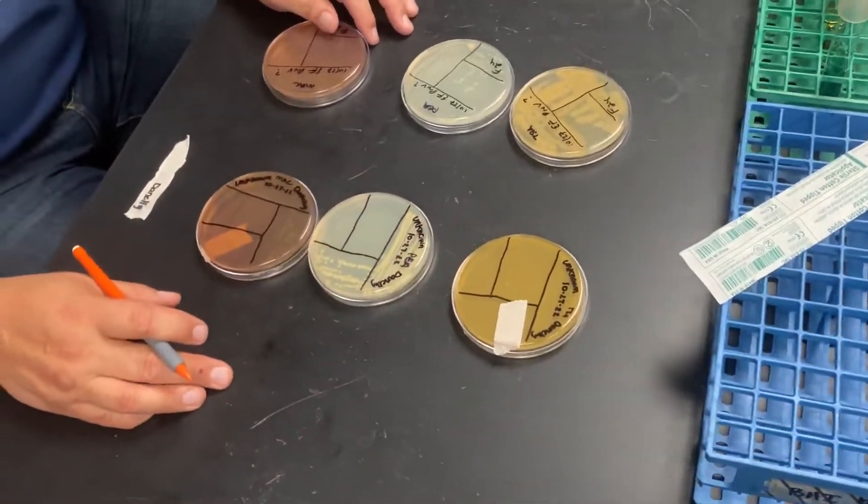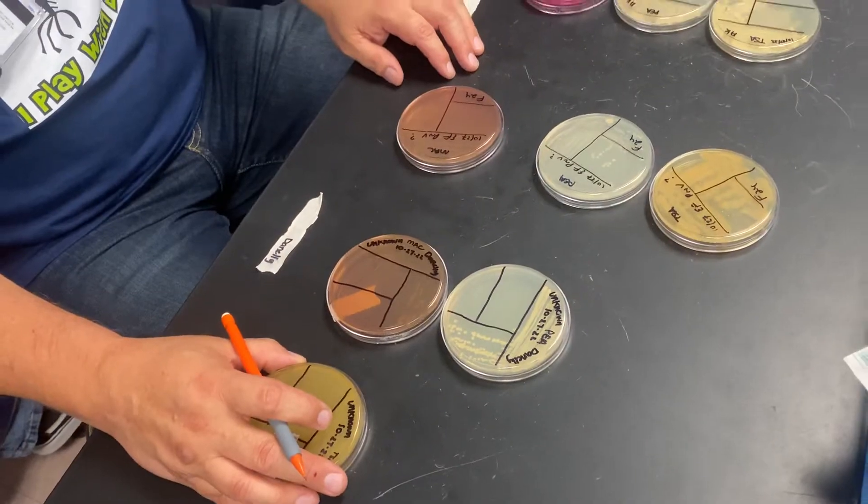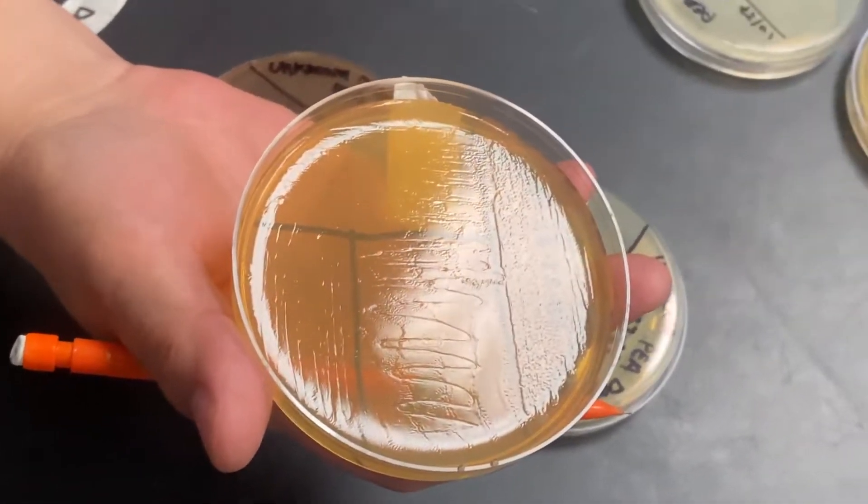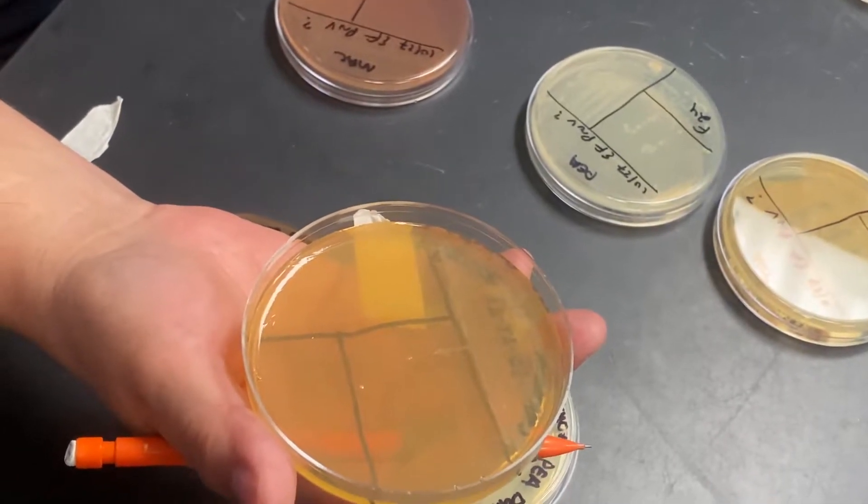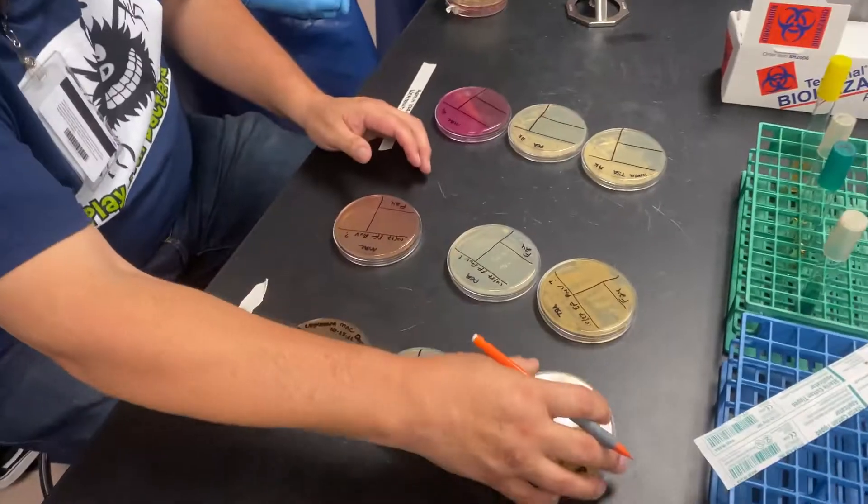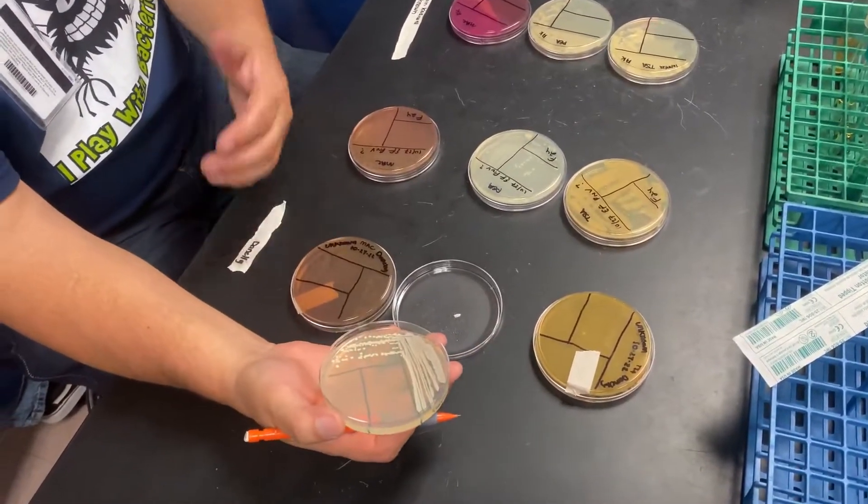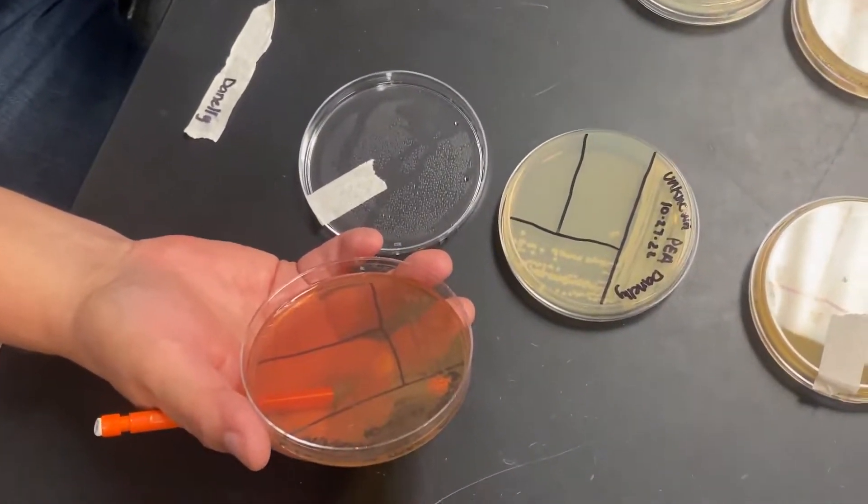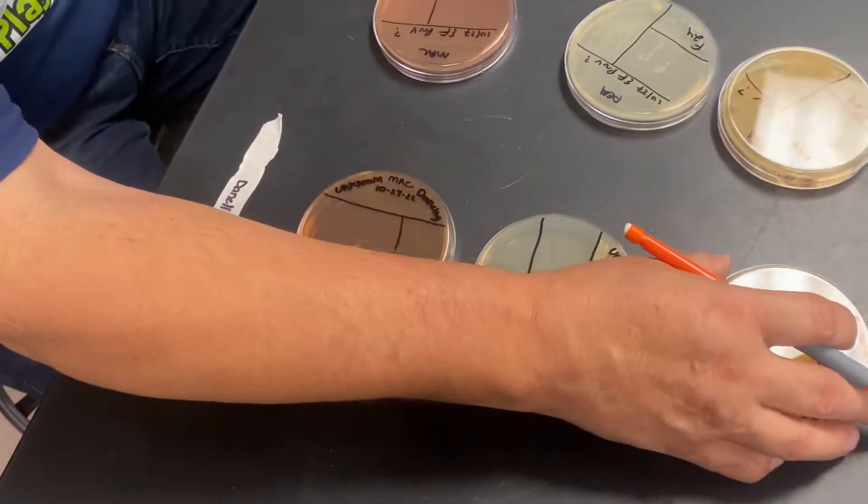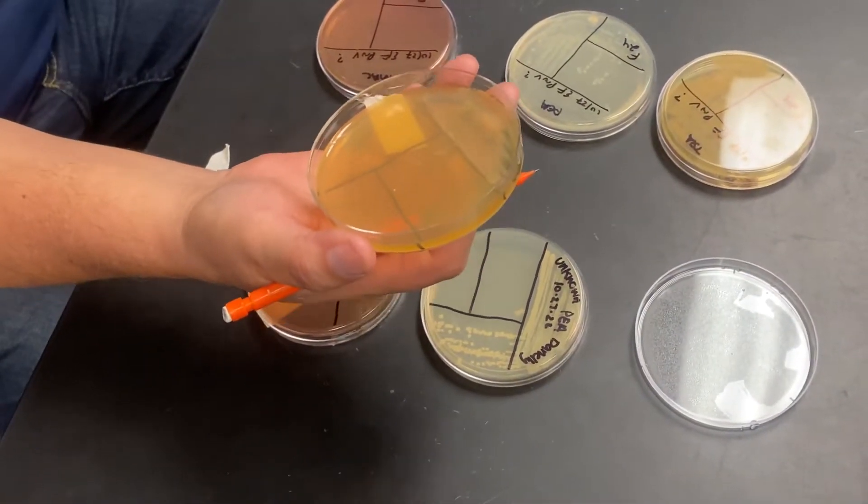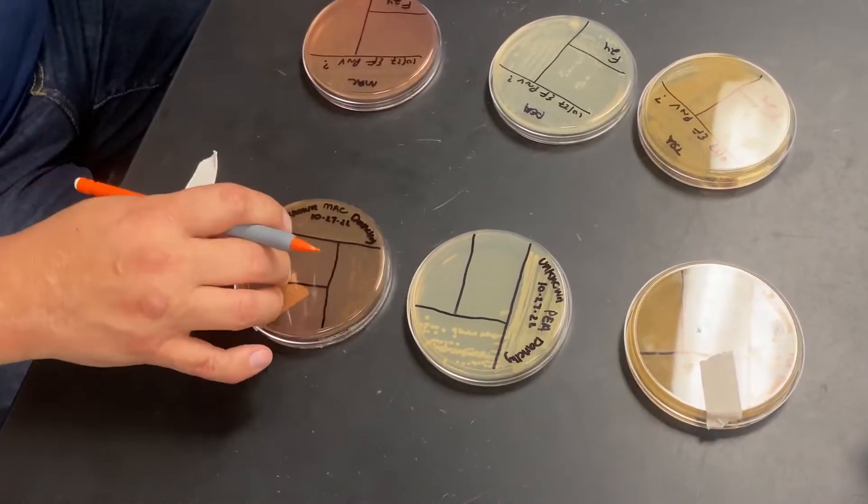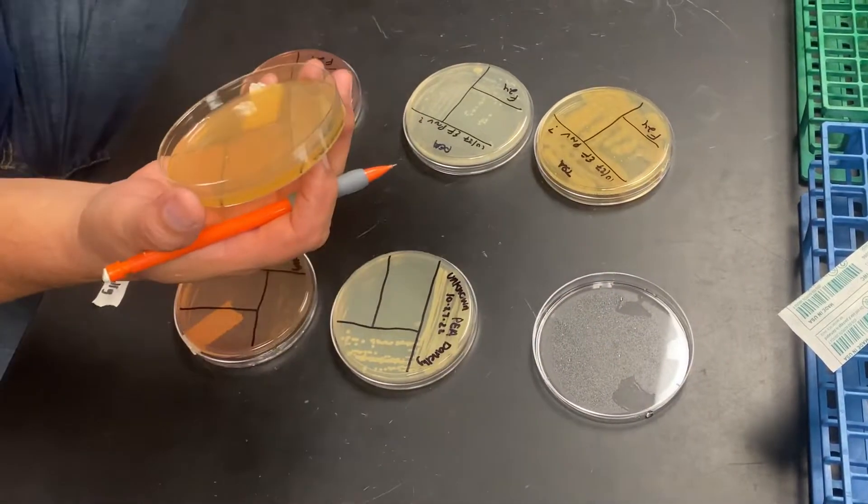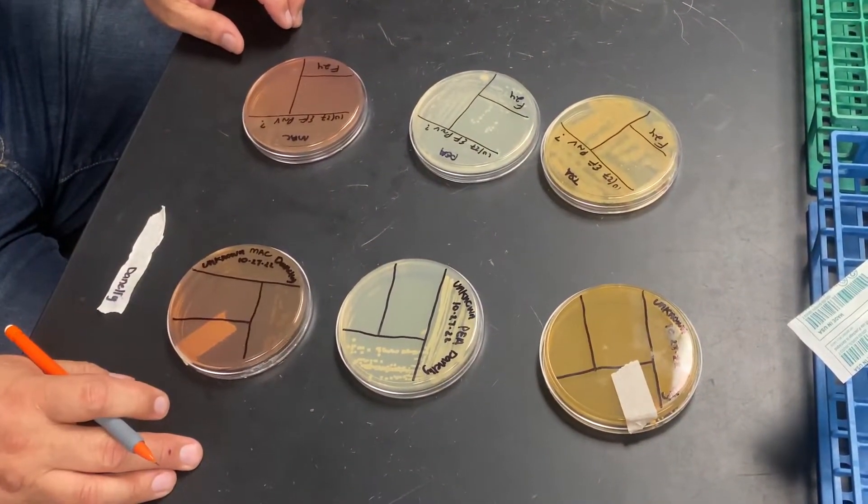Now this one is a whole different ballgame. This one has a very aggressive gram negative. And how do you know that? Because it is growing over the entire plate. It has covered the entire plate. And Isabella likes this very much because it smells great. So now if we look at these other two plates, what you're going to notice is this one has a beautiful white colony, right? This one has a colony that is lactose non-fermenting. But none of them are showing the organism that's just growing all the way across. So if this organism is gram negative, and we know that the organism here is very aggressive and gram negative, the organism that's covered the entire plate is the organism that is here. The other one, the little white guy, is gram positive.